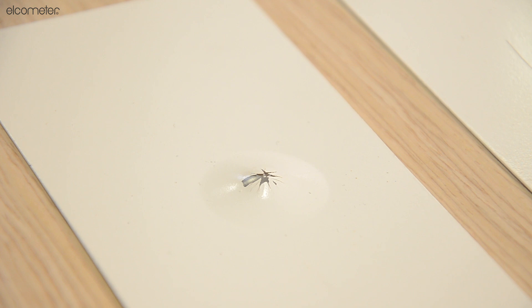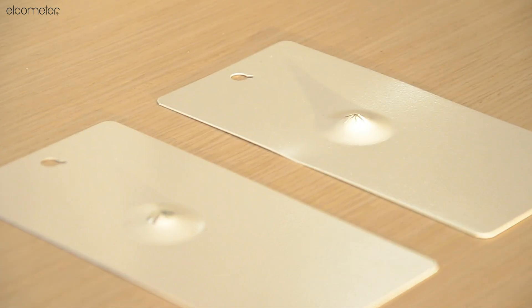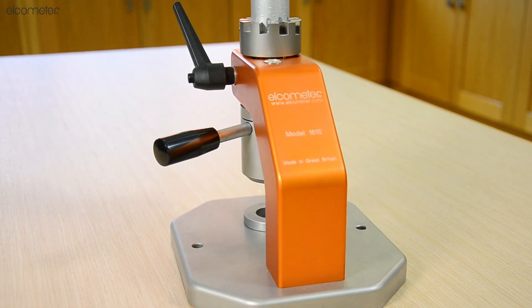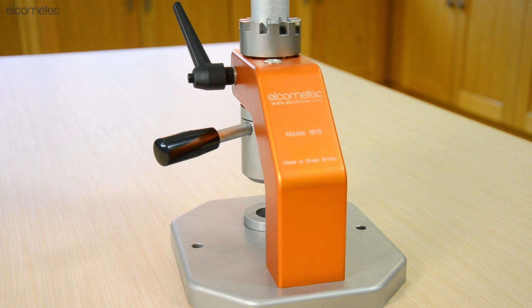In order to evaluate a coating's performance to direct and indirect physical impacts, we have developed a tester that produces results that are repeatable and reproducible.